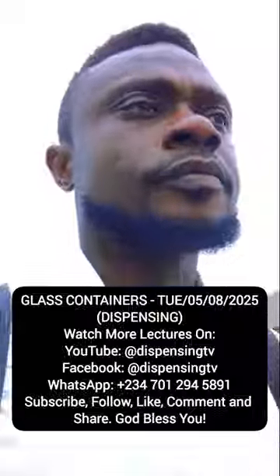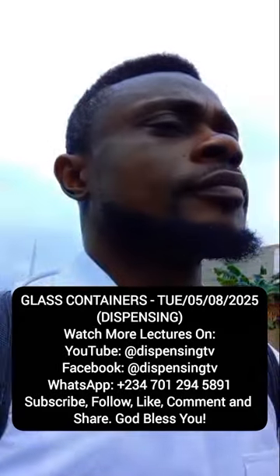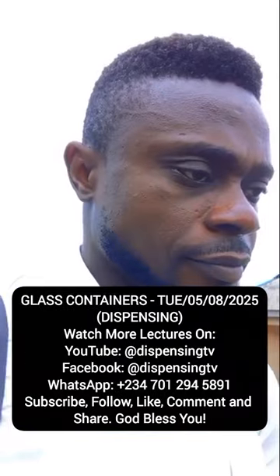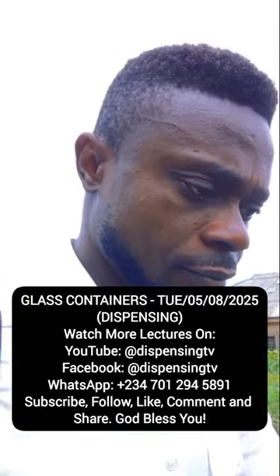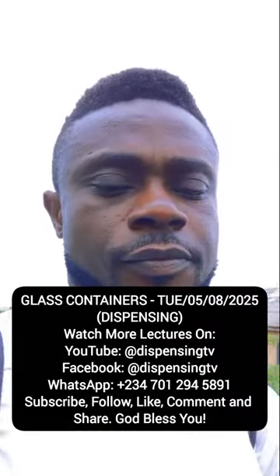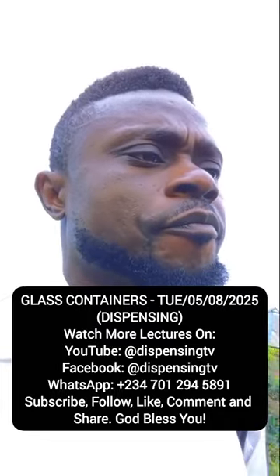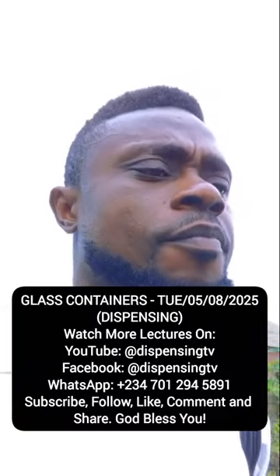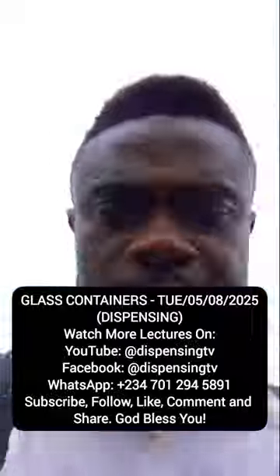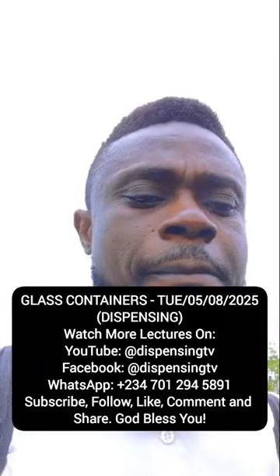So this type 1 glass is highly inert, and it has a very high melting point. Because of that, it can withstand a high temperature range. That way you can use them in boiling water and for heating substances. They also have high resistance to strong acids. So they resist strong acids, alkalis, and all types of solvents.